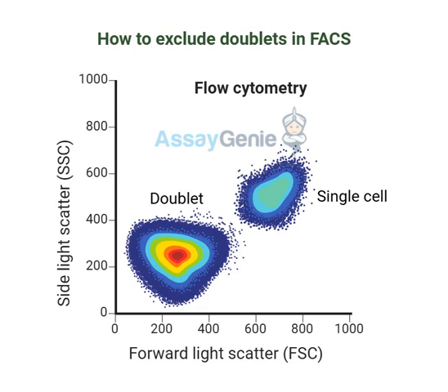I love that analogy. So they're using lasers, shadows, and even textures. What other clues help scientists catch these doublets? Well, get this. FACS machines are even more sophisticated than that. They don't just look at the overall size and graininess, they actually measure the cell's area, height, and width as it passes by the laser. Hold on. Area, height, and width? It's hard to picture measuring something that small in 3 dimensions.